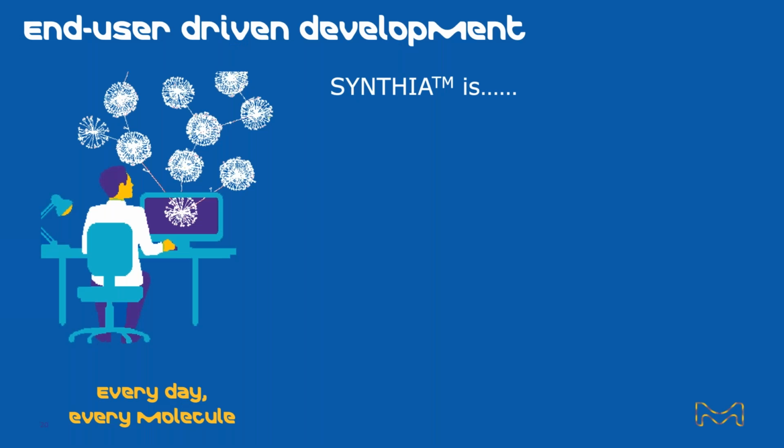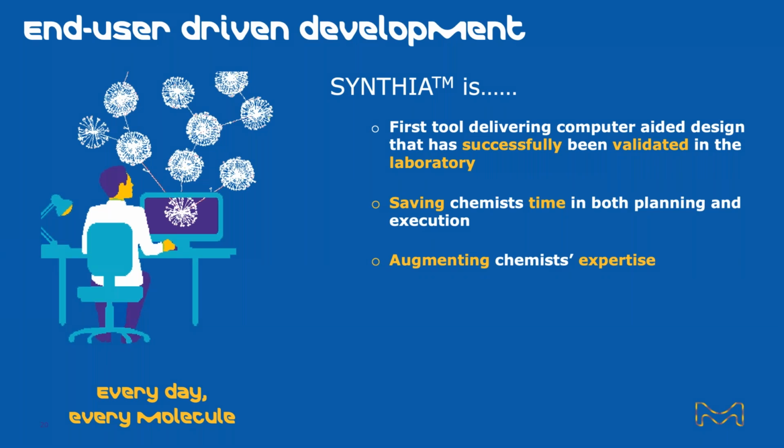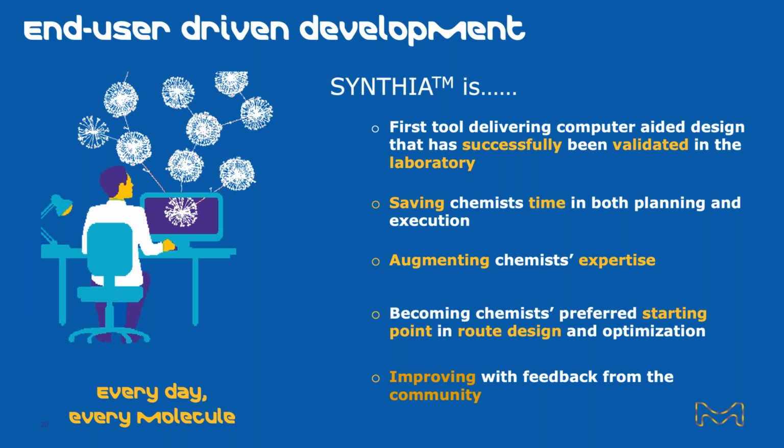So just to quickly wrap up, we've been able to show that Synthia really is the first tool to deliver computer-aided design that has successfully been validated in the lab. It's been able to save chemists time in planning and execution. This is, of course, a tool to augment your expertise as a chemist. So, another tool in your toolbox to help you do your job even more effectively. And this is really becoming the chemist's preferred starting point in route design and planning. And as we have more and more chemists using the tool, we're able to use that feedback to help improve it. And we are really in a very end user focused development phase now.